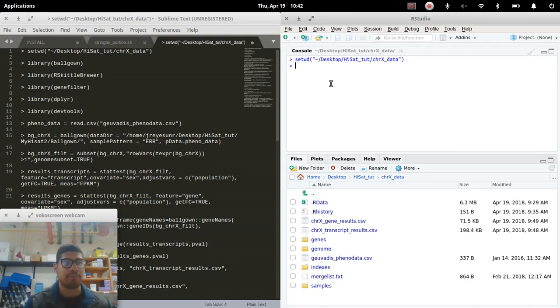Now beforehand you have to install these different libraries, and that was the main issue I had with the previous version of R that had been installed. I wasn't able to get any of these at all. It was like R 2 point something, so it wasn't working. But that will work now.